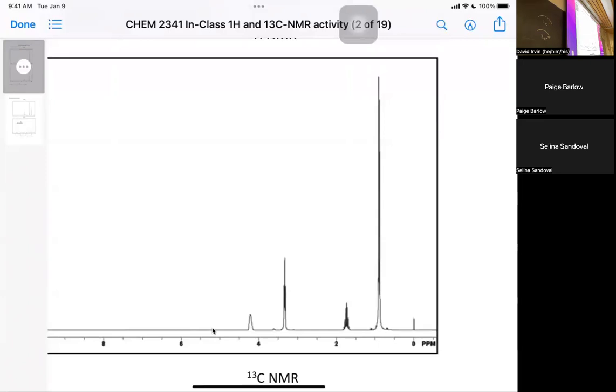All right, let's go and look at what we have. I'm going to do it backwards now. I'm not going to look at the structures. I'm going to look at what we see first. So the first thing we see in this spectrum is 4 signals. And one of those signals is also 1, so we have an amine or an alcohol in our first compound here.